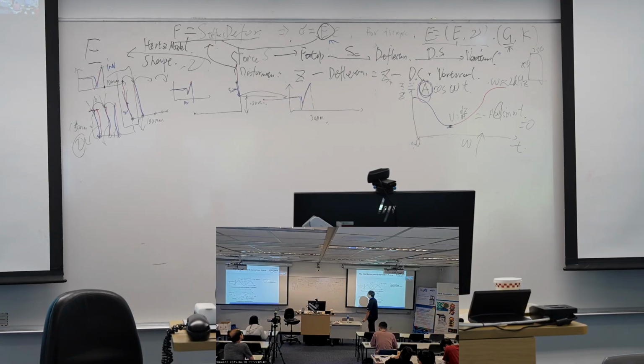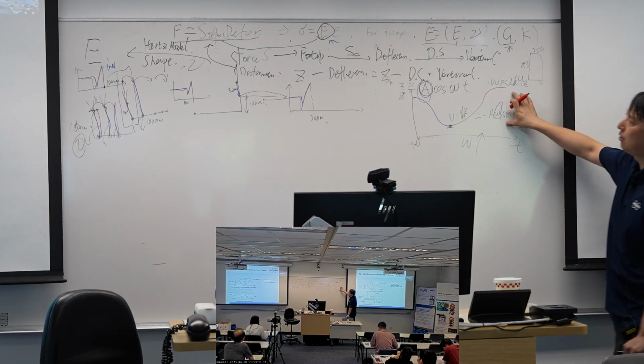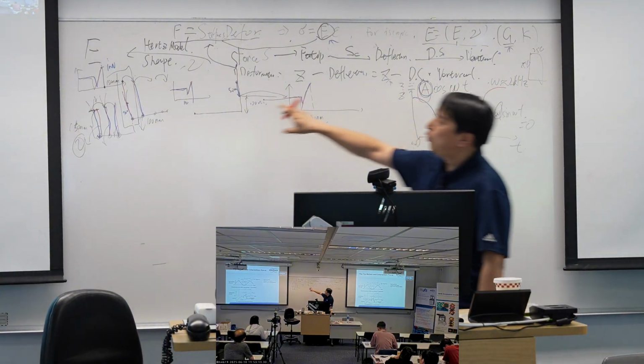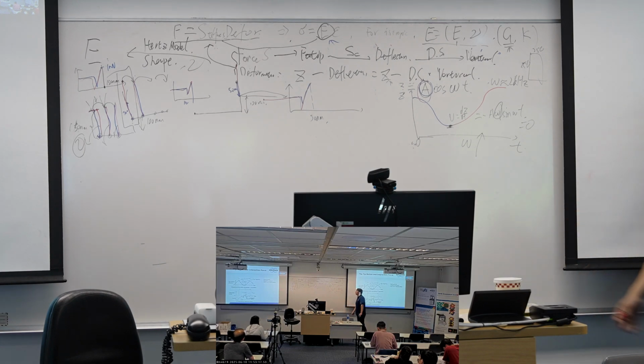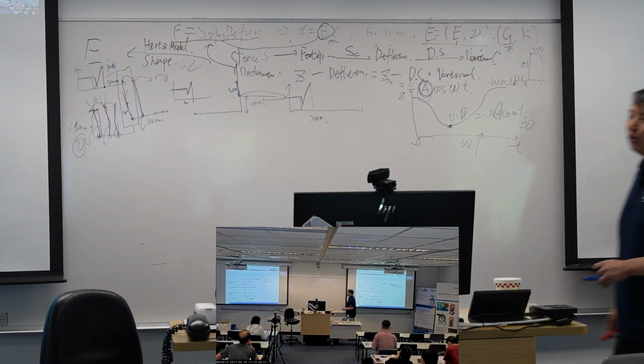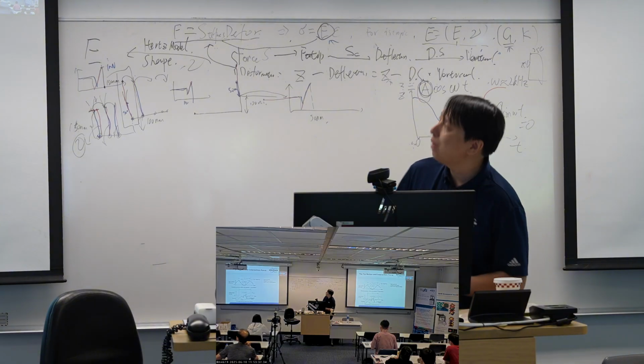So our idea is how we can apply this idea for this step. This afternoon we will explain this part, and after that, you can know how the PeakForce QNM or the PeakForce tapping is moving, and then we can better use it for our modulus mapping.